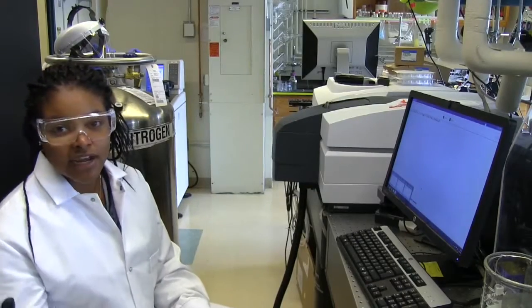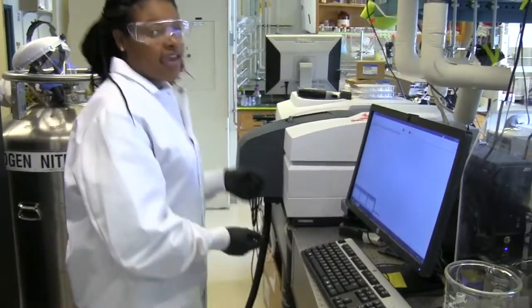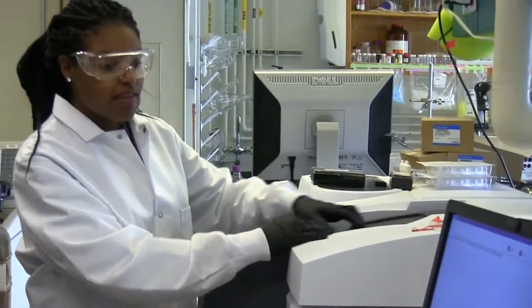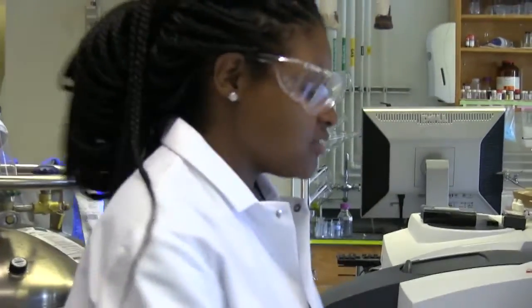I take the samples that I diluted, and then I put them in cuvettes, glass cuvettes, and then we can place them inside of the machine. And then the computer has software that can analyze it and measure the absorbance.